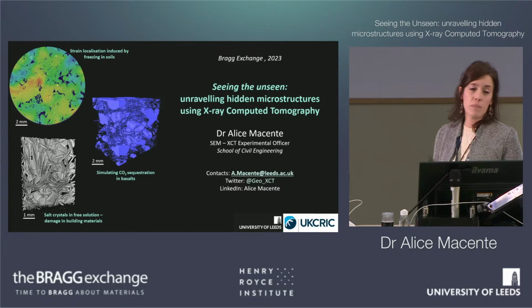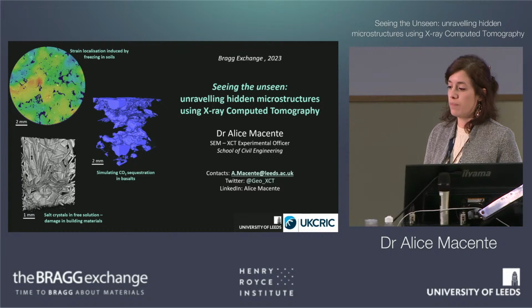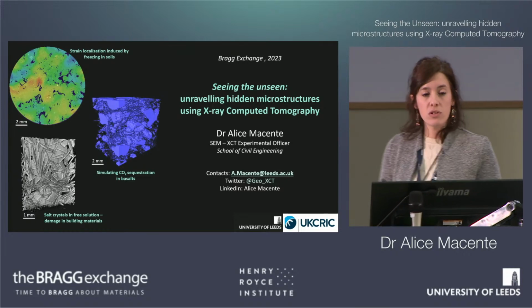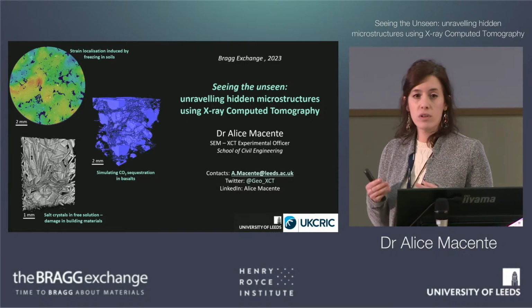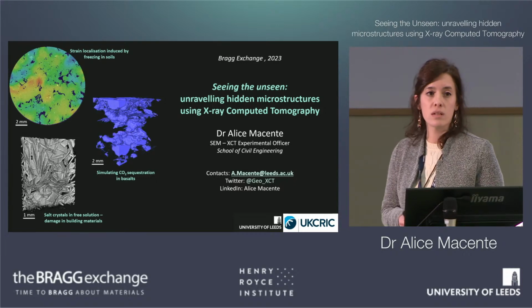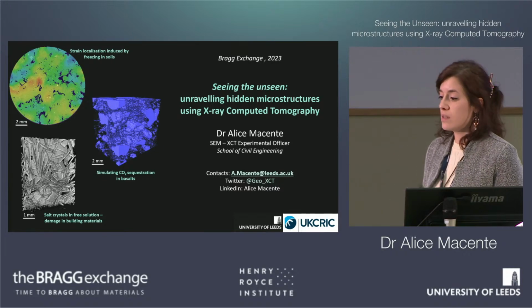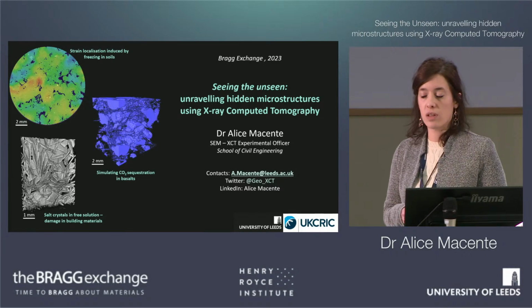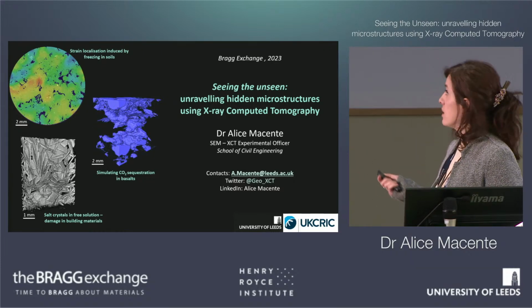And as we learned in the past few talks, changes in the microstructures are quite important because they can drive changes in large-scale behavior. So my research focuses on using non-destructive imaging techniques to monitor and quantify the evolution of microstructural changes under dynamic conditions, such as temperature, load, or fluids, and see how these can affect large-scale behavior. So what are these non-destructive imaging techniques?